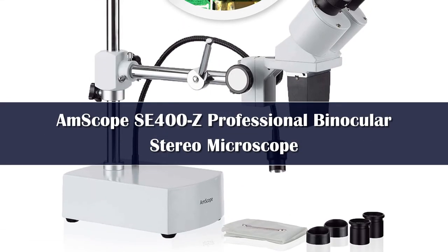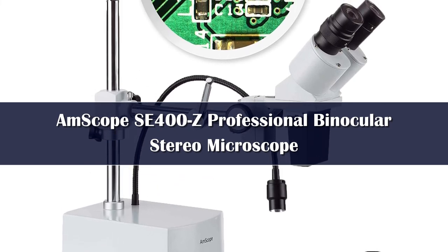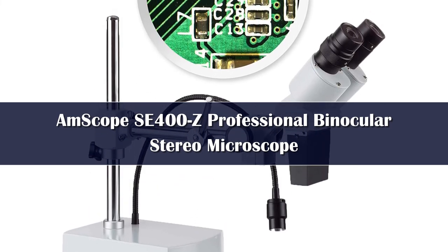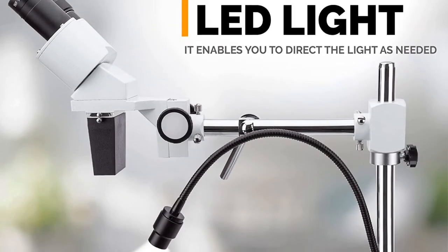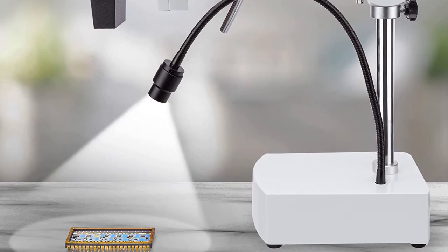Number 1. As you'll notice on this list, Amscope is one of the most popular brands for stereo microscopes sale online. The company makes a wide array of models, including this professional grade version. That said, feel free to use it for at home experiments as well as engineering and tinkering.